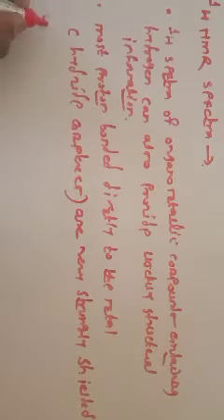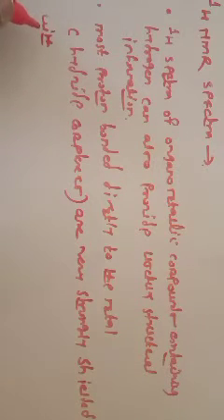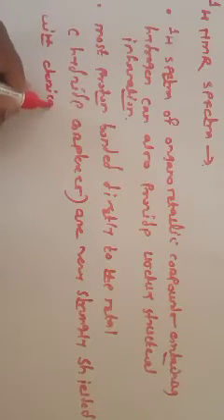You are very much familiar with shielding and de-shielding, which we already discussed in organic chemistry for studying organic compounds. So the protons bonded directly to the metal atom in hydride complexes are strongly shielded. As shielding increases, the chemical shift value decreases.